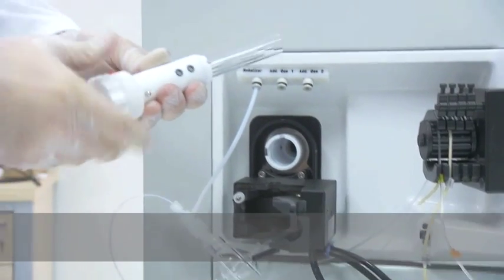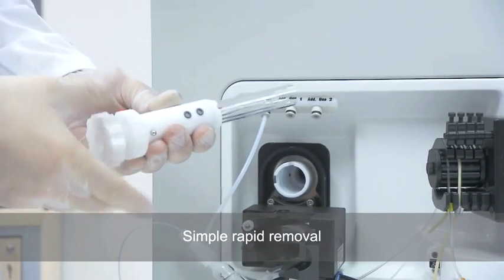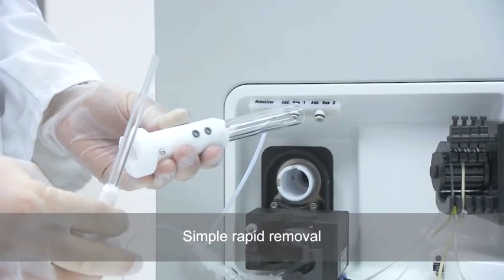A bayonet fitting torch ensures simple, rapid removal for inspection, cleaning, or replacement.